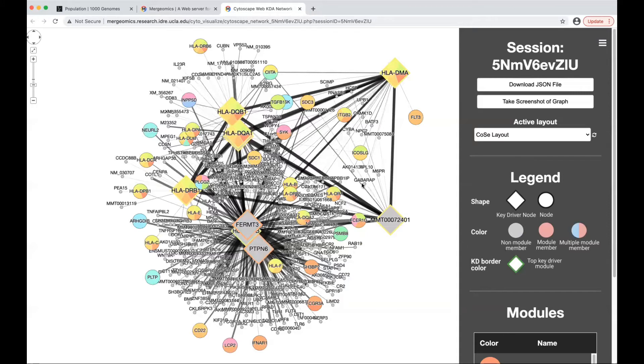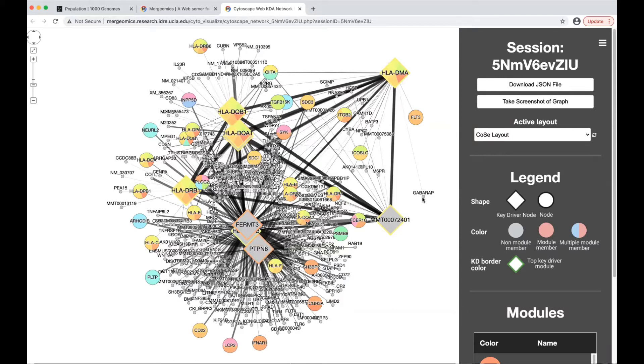The color is important, as this will signify if it is a non-module member, as in the case of the small gray node, or part of a module signified by one color.